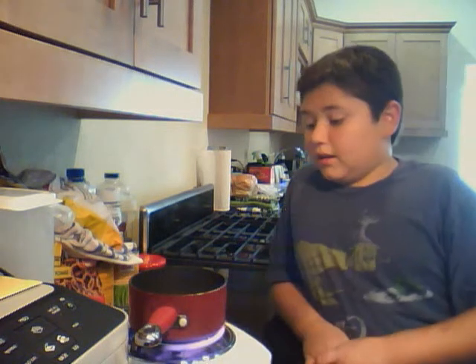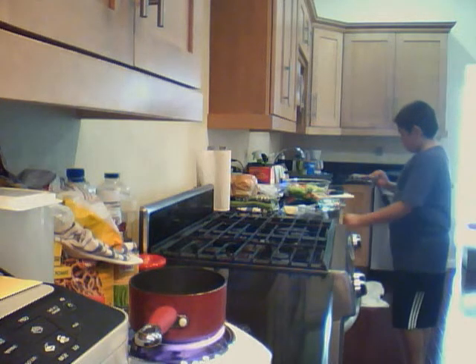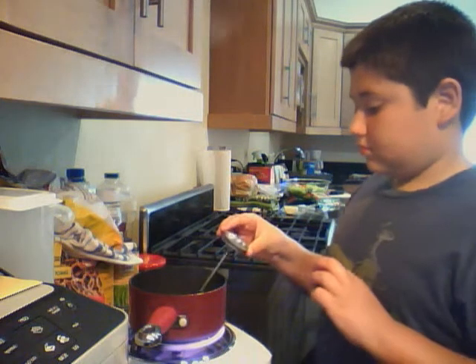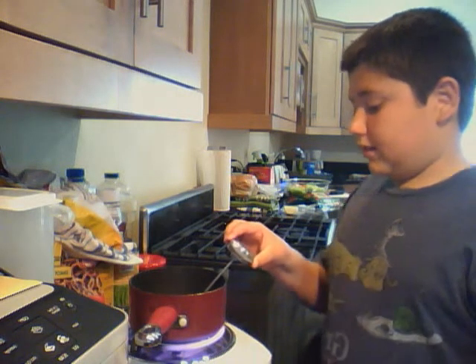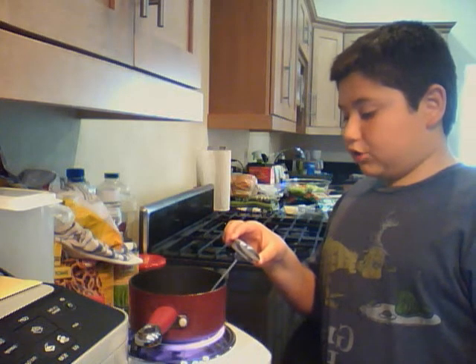Right now it's bubbling up so high it's about to touch the rim. It is steaming a lot and the hot plate down there is really hot. Let me get the thermometer and see what it is. It's doing very high — about 204 degrees.